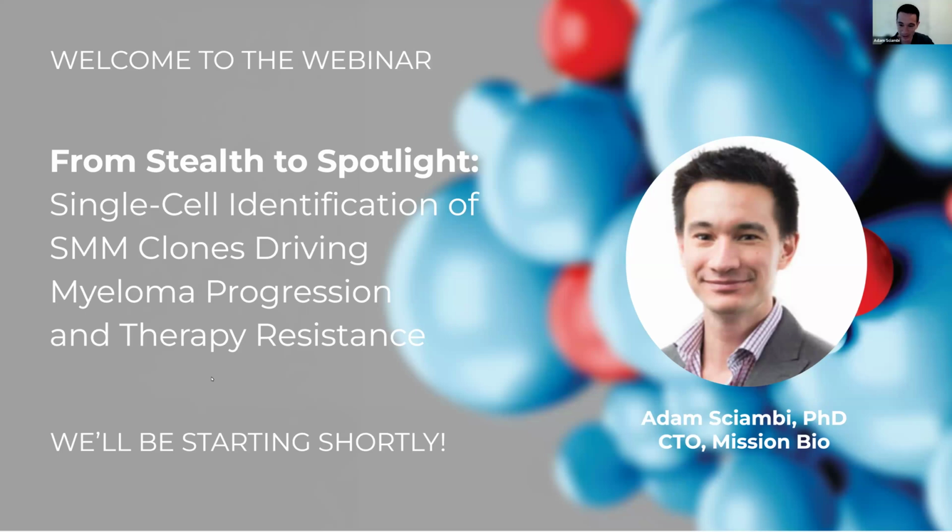on multiple myeloma. And there are two angles that you can look at when analyzing multiple myeloma, represented in the title of this presentation. One is understanding disease progression, and then also getting some sort of therapeutic guidance for multiple myeloma from our platform. I should emphasize that our platform is research use only, but I think there's a lot of potential here.